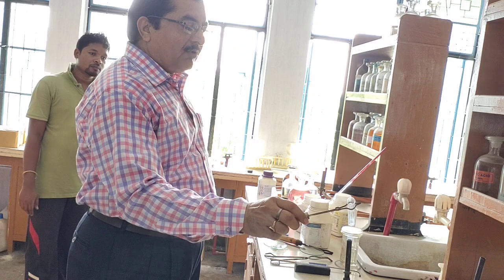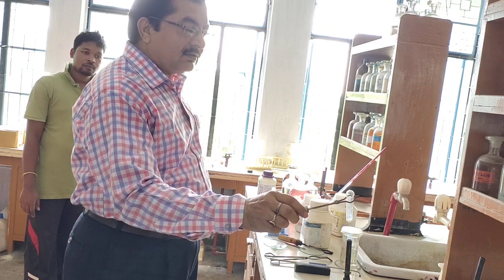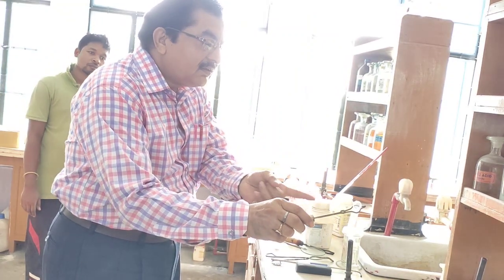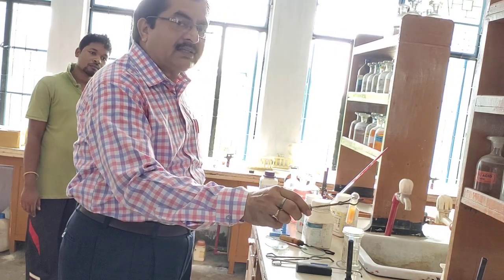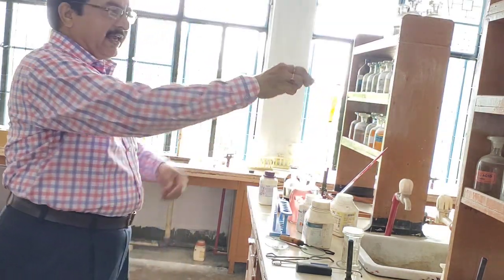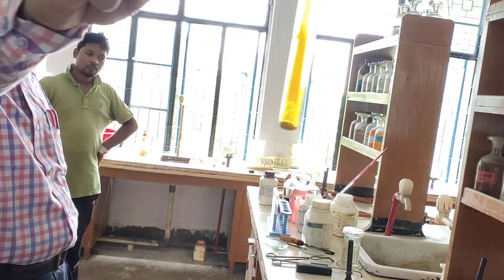When you heat it, you will find, see, cracking sound is coming, and see, the brown gases are coming out. Cracking sound with brown gases. Now we want to heat much more. Cracking sound with brown gases is coming. It means nitrate salt is there. Alright.